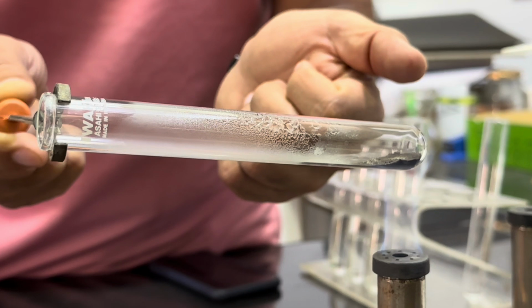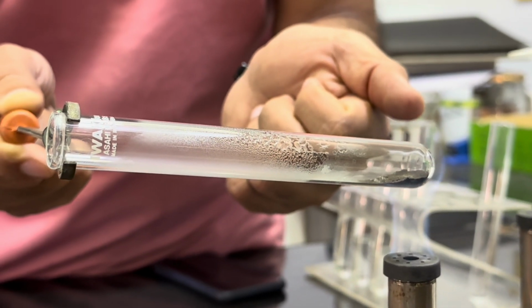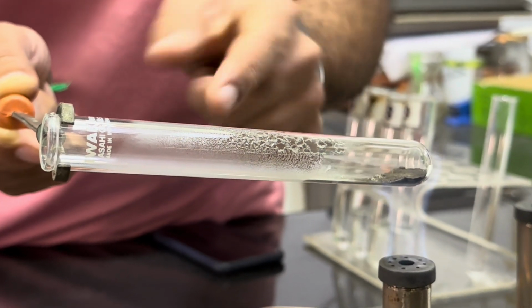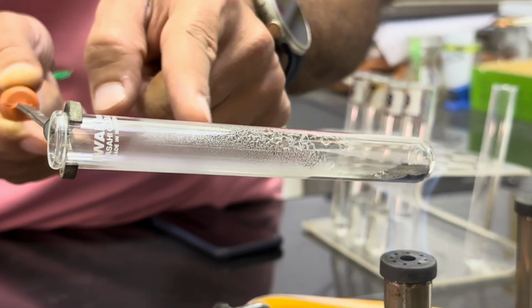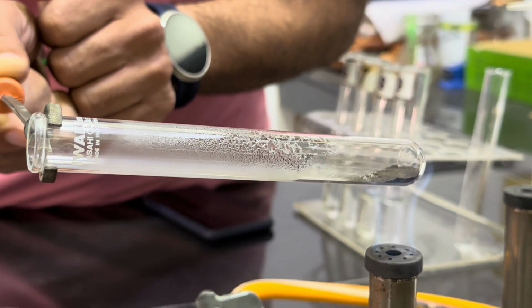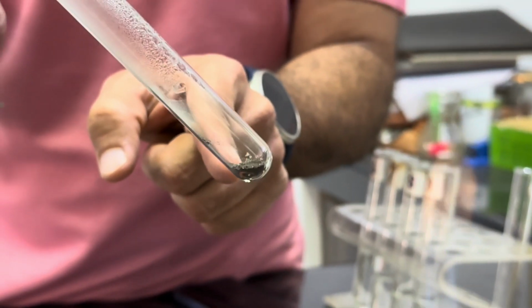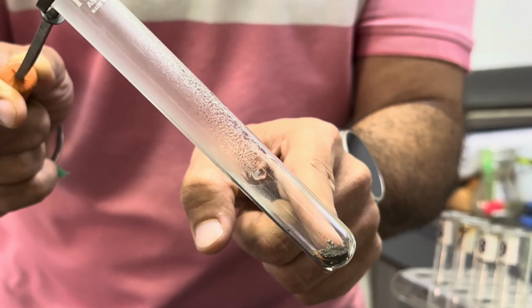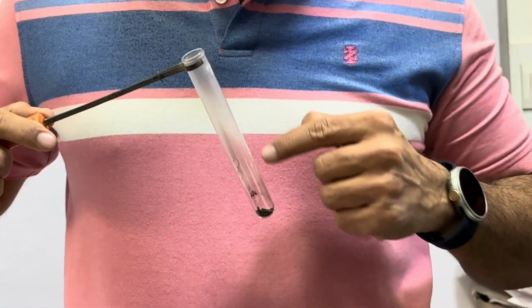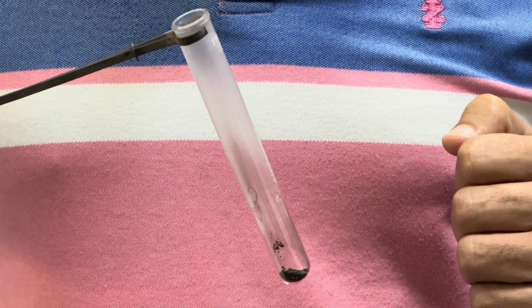And now we can see the total solid content from green has turned into gray or black solid. And the neck contains the condensation of water vapors. Yeah, that's done. So we can see it's totally a black solid now. That black solid and condensation on the neck of the tube. We will record this observation in the column now.